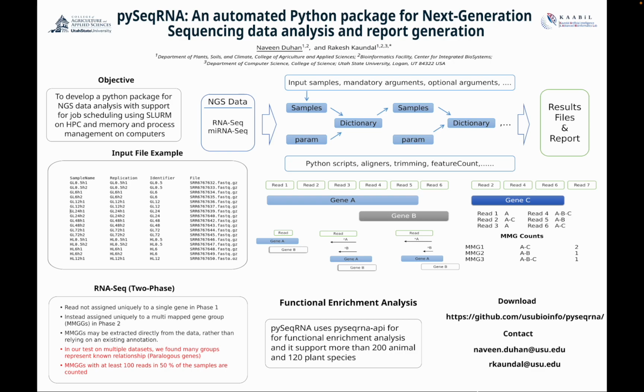The other scenario is that for one gene the read is mapping 100%, and on the other gene only 70 or 80% of the read is mapping on the gene. And in the third case, one read is mapping 100% on gene A, but on gene B only a fraction matches. In that case, we disregard those multi-map reads.